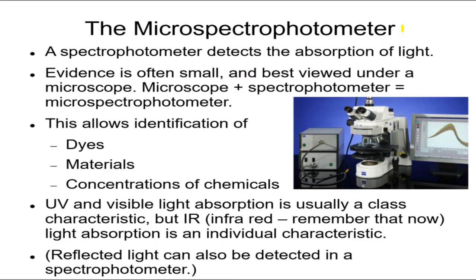So now, when we're talking about, let's say, fibers, and we want to know about the color of tiny scraps of cloth, really tiny threads, or even tiny grains of some matter that ended up on a suspect's shirt, we have tiny little things to identify, and one way is by sending light.